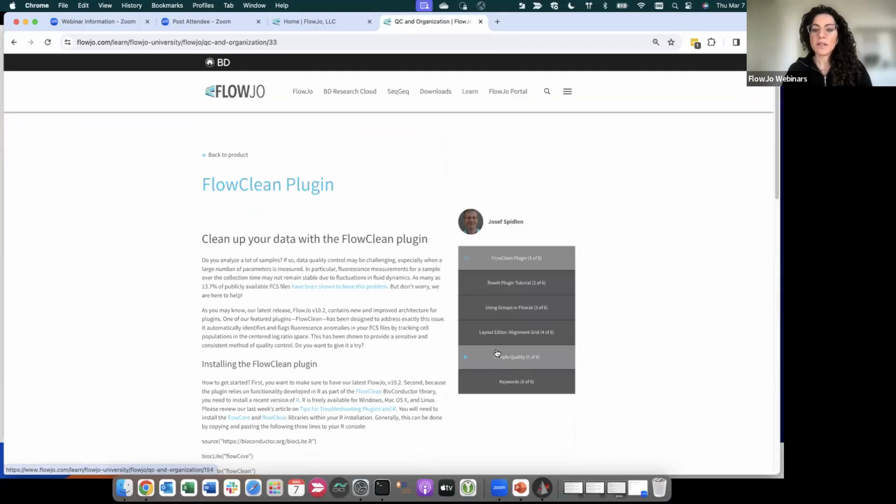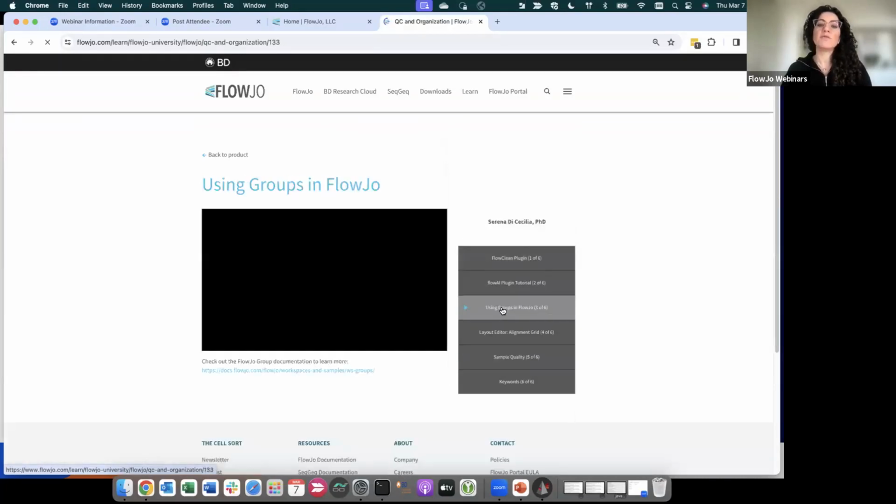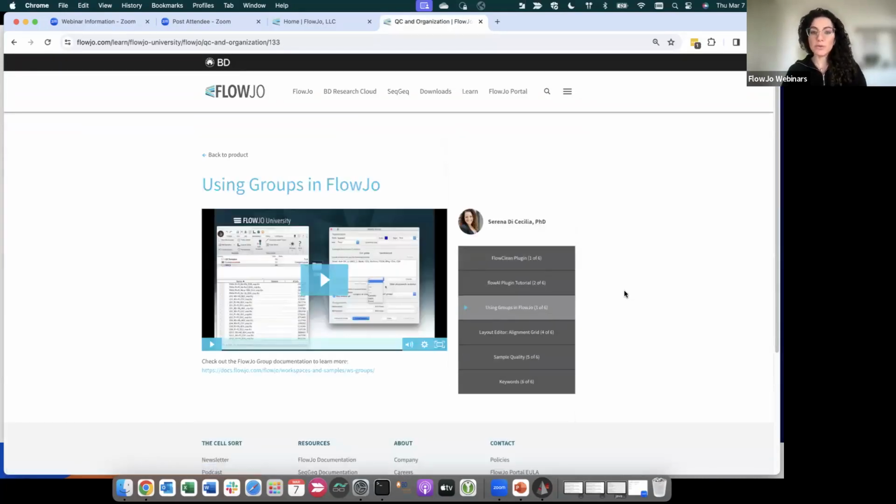So for example, if I want to use groups in FlowJo and I don't remember how to do that, you can just click on that and you will find this short video of 5 to 10 minutes max that is pointed to that specific action.